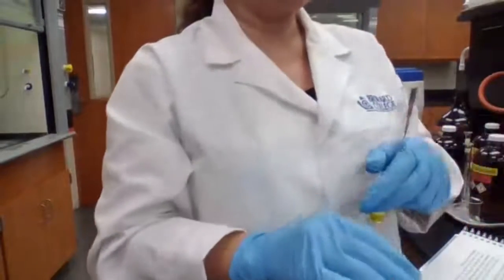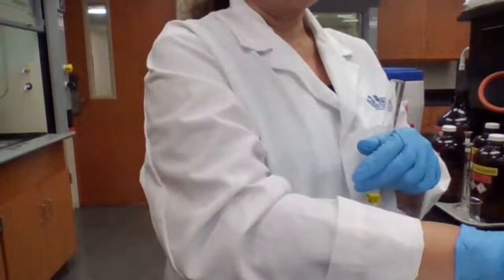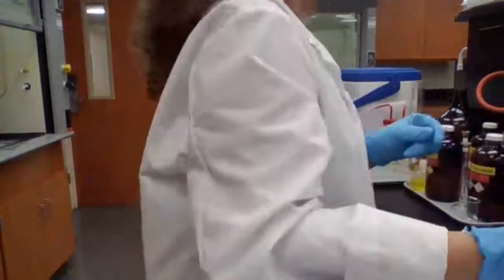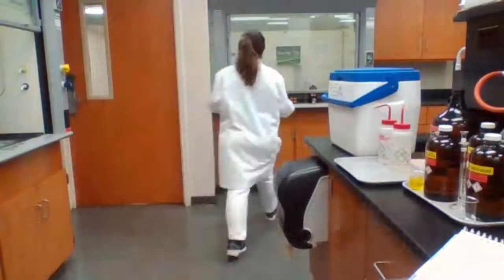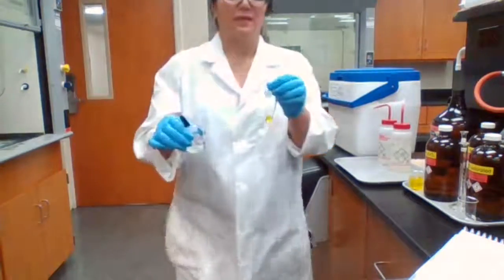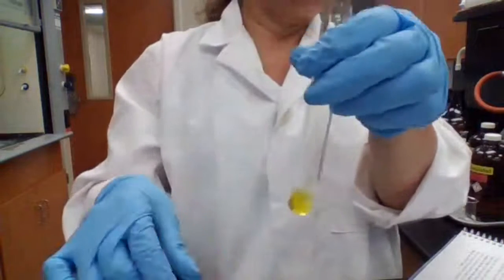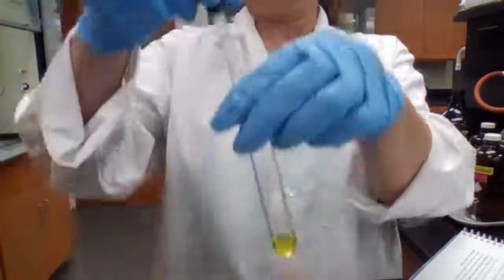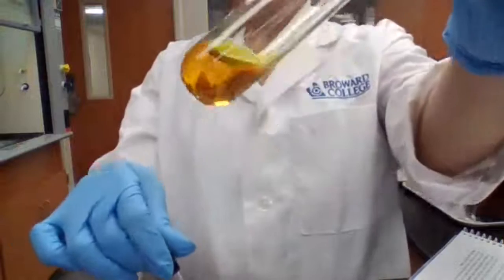And to this, we're going to add 3 molar H2SO4 dropwise, until you see the color change. So I'm adding H2SO4. Do you see the color change? Okay. Record the new color.